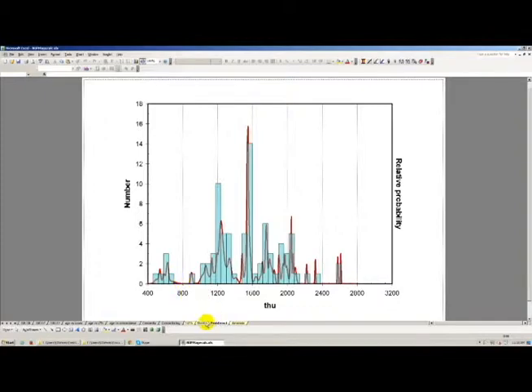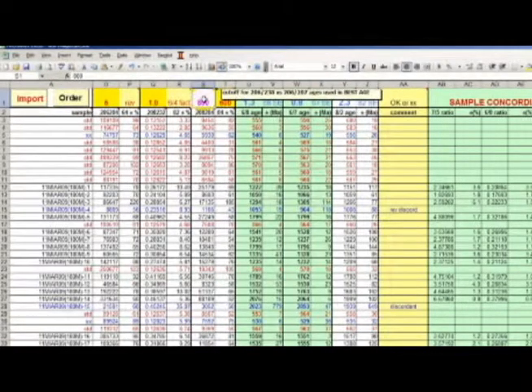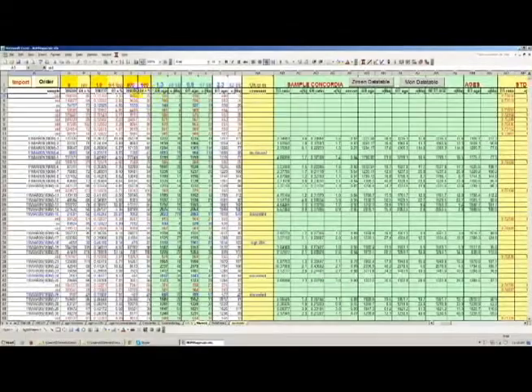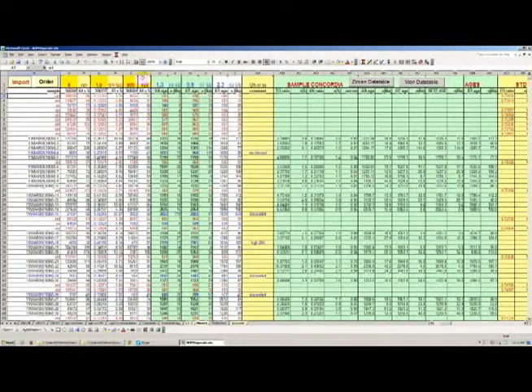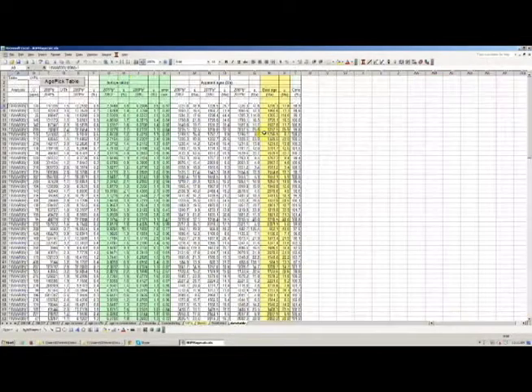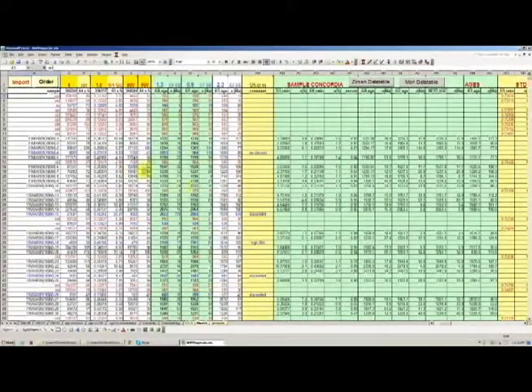So the safe way to go would be to go back to Sheet 1, and on that threshold, that cutoff, set 800, and then hit Order again. So when you change something in this Sheet 1 tab and then hit Order, it's going to get refreshed in the Sheet 1 tab, but it's not going to get refreshed in the data table. So an important thing to remember is that every time you change one of these parameters and hit Order, you also want to click on the Zircon data table again. So it's going to export all those values back to the data table, and that's going to represent the changes that you just made, every time that you hit Order and then recalculate some of these values and reapply some of these filtering thresholds.